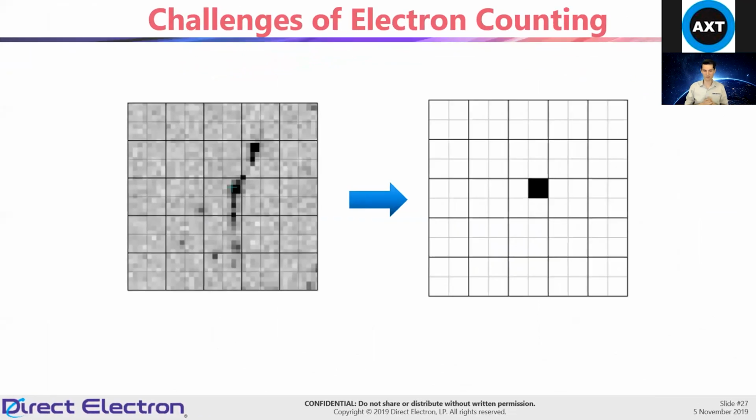And the real hard part about electron counting is that because they're poorly behaved in the silicon itself, it's difficult to say what pixel did it enter? If it entered one pixel, did it actually go in that one, or did it come from another adjacent pixel? And so if you have real streaky events, then you have to guess where the center of it is, and this can lead to performance degradation and other issues.